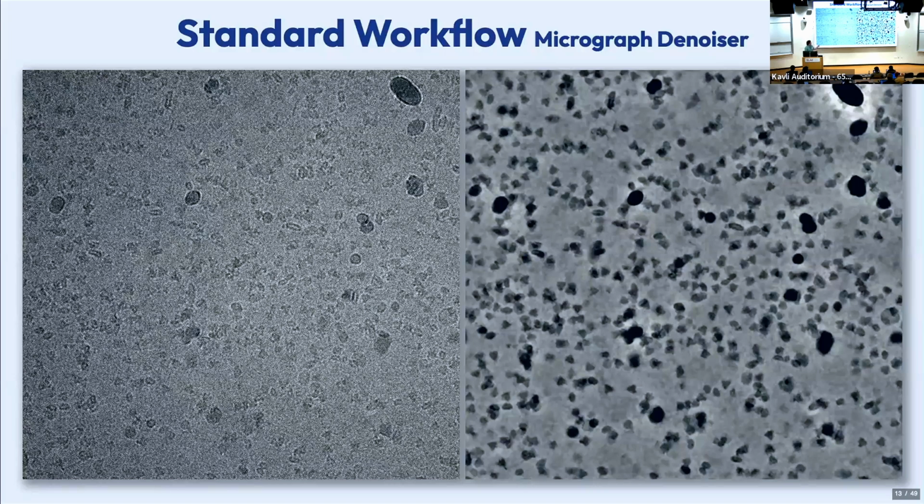The main difference is that with the denoised image for template picking, you don't have to think about CTF. The denoised image has already had the CTF baked in, but CryoSPARC handles that for you automatically. If you turn on the use denoised image for picking, it will also turn on the setting to ignore the CTF. So it's all baked into the thing.